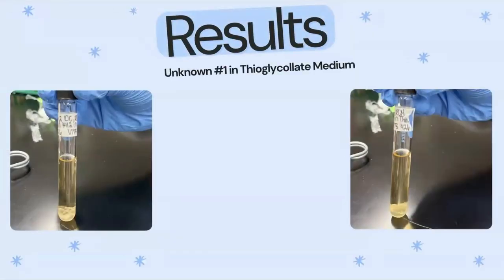And when we utilize the unknowns, starting with unknown number 1, we did see quite an interesting pattern of growth here in this test tube. It looks like an interesting type of cloudy appearance once again at the bottom, but this one does seem a bit different compared to the other two that had this similar type of growth. This cloudiness appears to be more defined and visible to the naked eye.